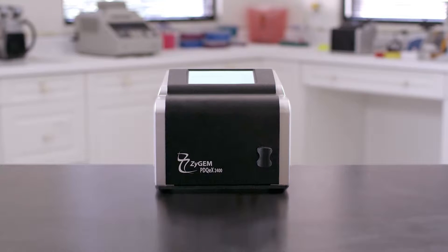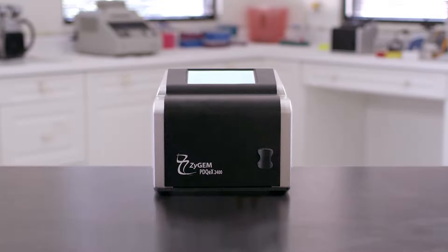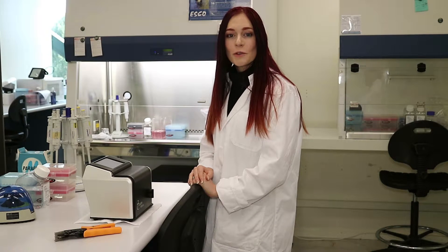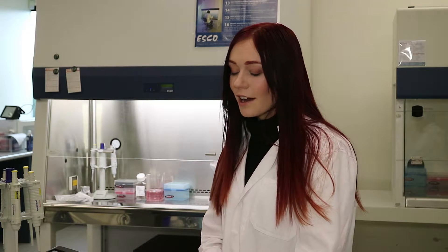Storage and nucleic acid extraction. The PDQX is an affordable device with a small footprint. This compact instrument allows scientists to extract DNA from 24 leaf, root and stem samples in under 15 minutes. This device is capable of extracting high quality nucleic acids for genotyping, sequencing and the detection of pathogens.